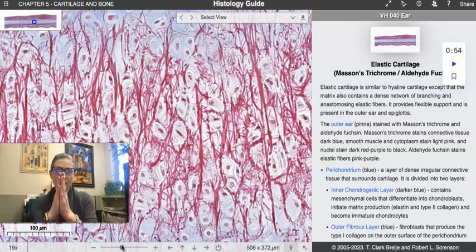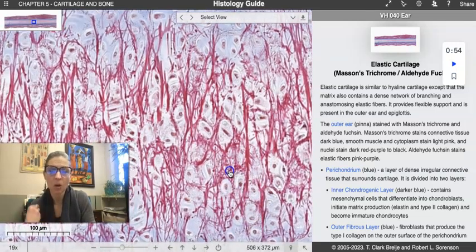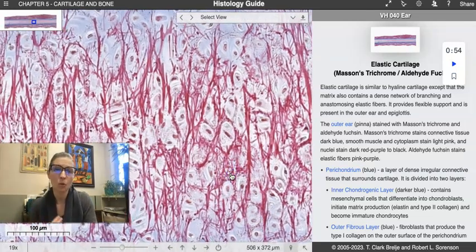So basically it would be the chondroblast or the osteoblast, and then the material right there. There's no spacing. There is no lacunae or that open chamber. And all of these are going to have an open chamber. So these are all adult cartilaginous cells. So these would basically be all chondrocytes. The same thing would be true for our bone cells. They would just be osteocytes.